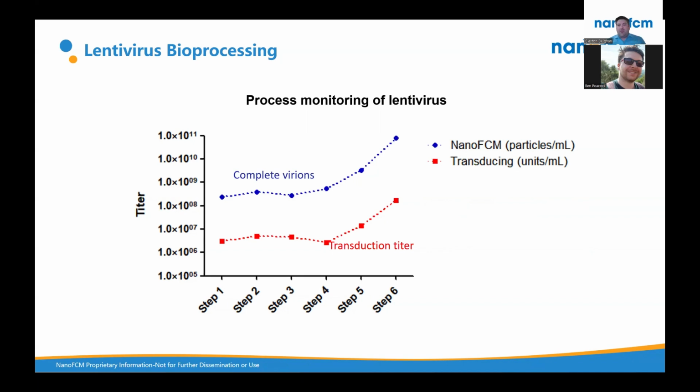And you can start to make earlier decisions about how to handle the material and whether it's going to be useful downstream, or if you're doing the different things we talked about in development, you can screen those things earlier without doing steps 1 through 6. You can screen them at step 1 and 2 and have this link back to the activity that's become known from the other correlative experiment.